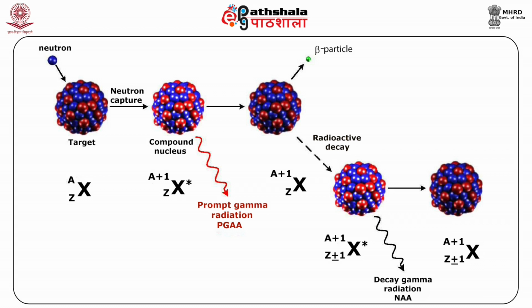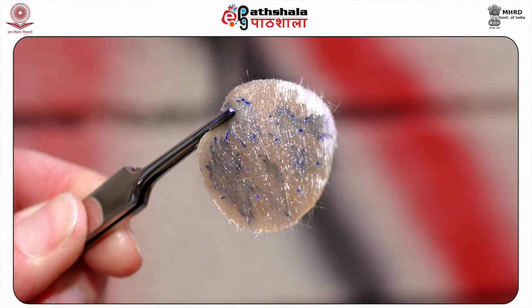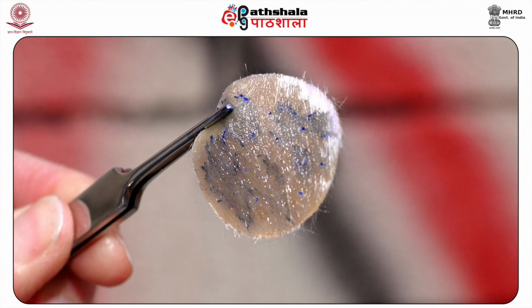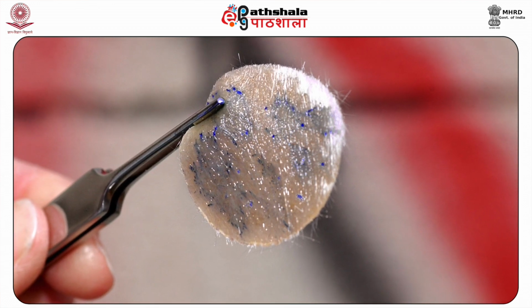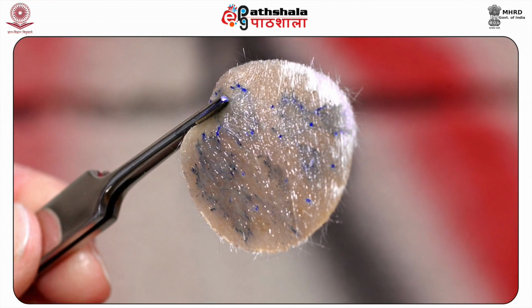For many elements and applications, NAA offers sensitivities that are superior to those attainable by other methods and are of the order of parts per billion, ppb, or better. NAA is generally recognized as a referee method of choice when new procedures are being developed or when other methods yield results that do not agree. Worldwide, its application is so widespread that approximately 1 lakh samples undergo analysis each year by NAA.